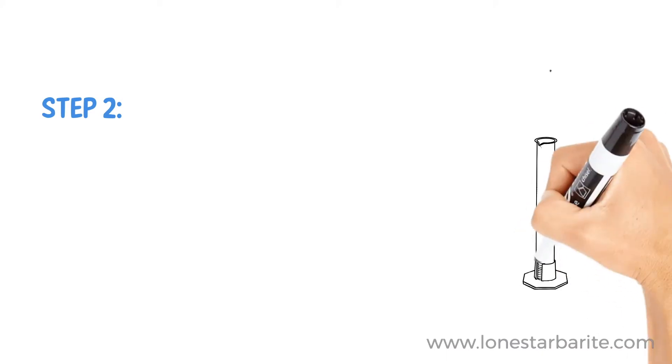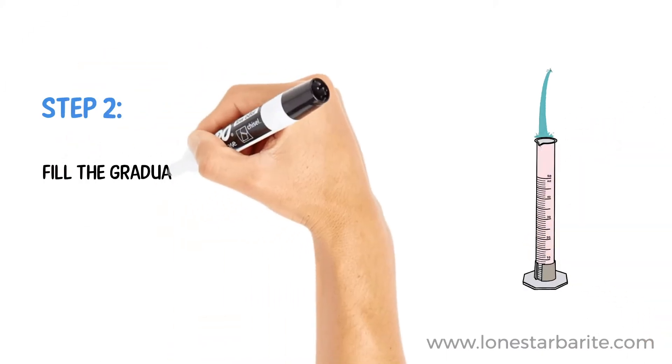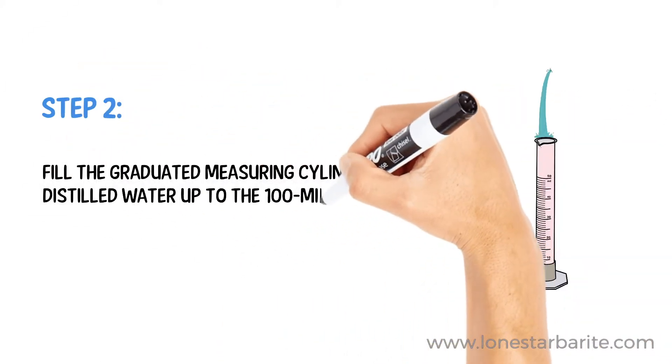Step 2. Fill the graduated measuring cylinder with distilled water up to the 100 ml mark.